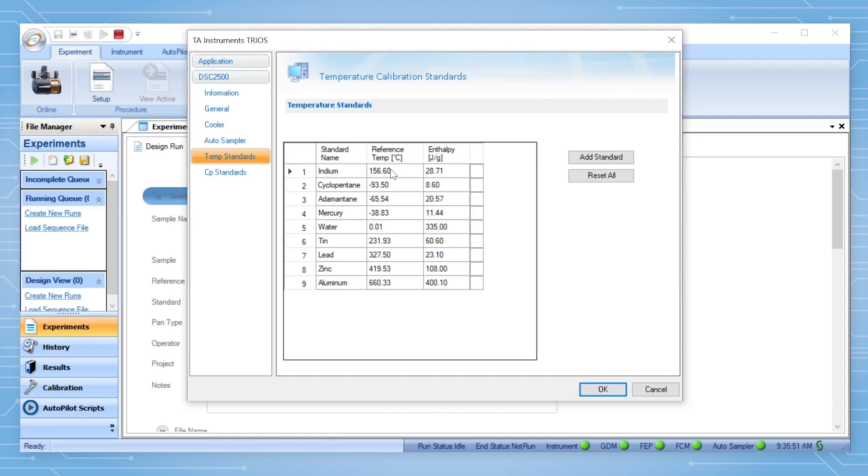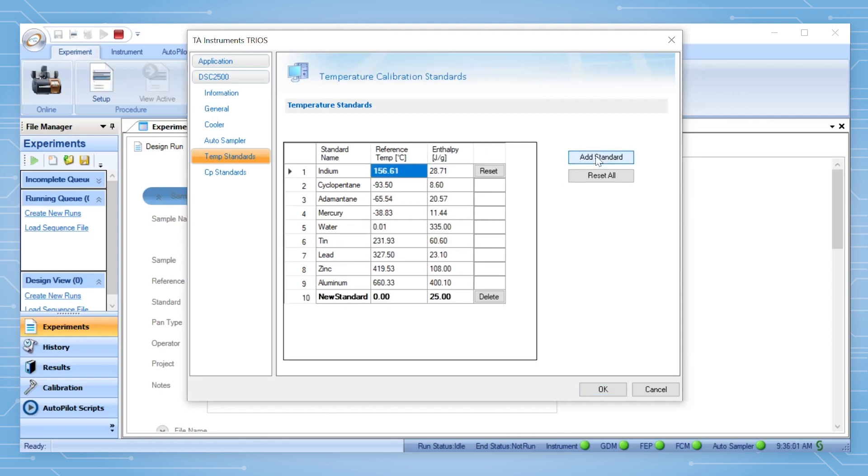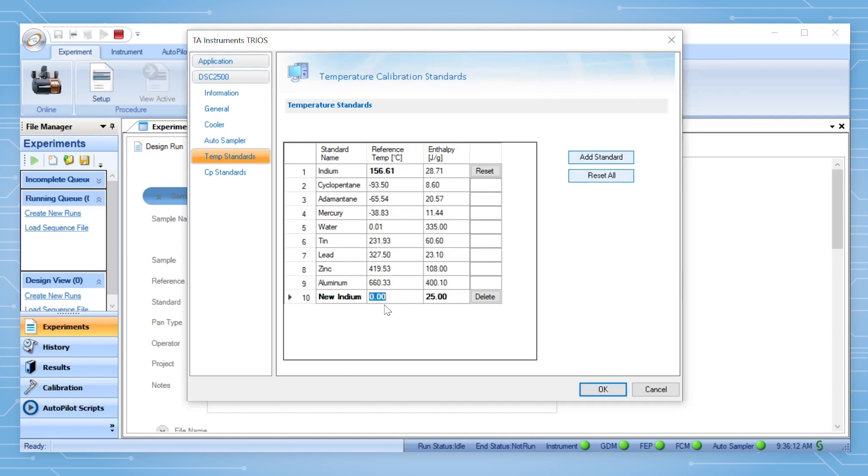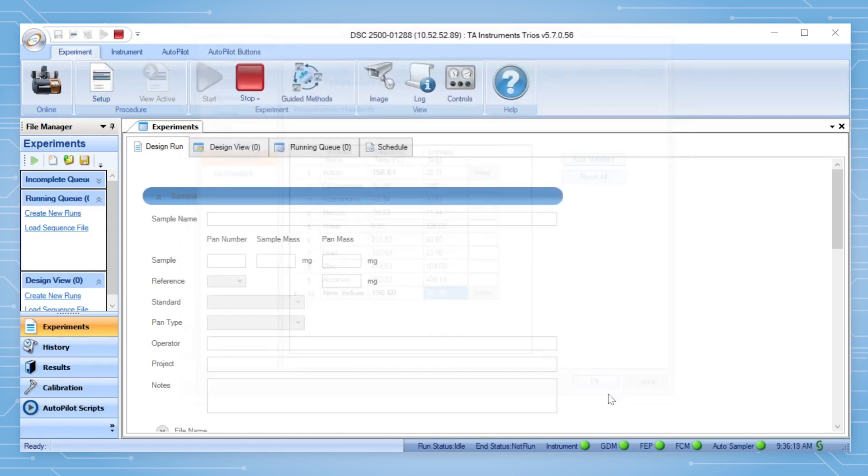For temperature standards, you can edit the value of existing standards by clicking on the desired field and editing it. You can add a new standard by clicking Add Standard and then input the standard's name, melting point in Celsius, and enthalpy in joules per gram. Then click OK to save the changes.